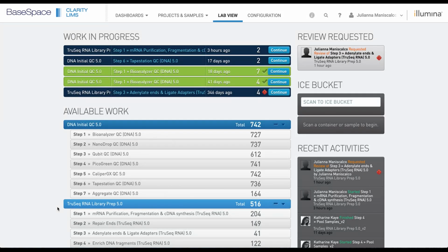We are going to learn how adding a submitted sample global field will affect the sample management page in the UI. If there is a field that you want to be applied to your submitted sample or your parent sample, the first thing you need to do is configure the field.